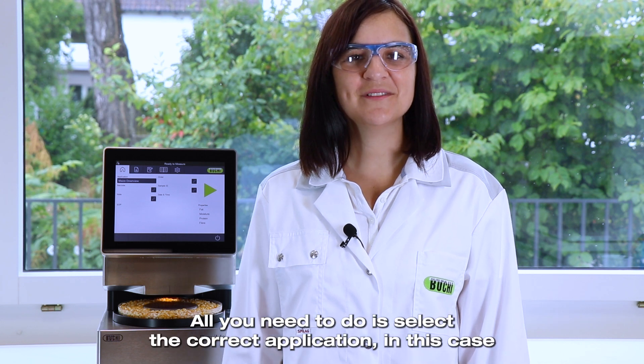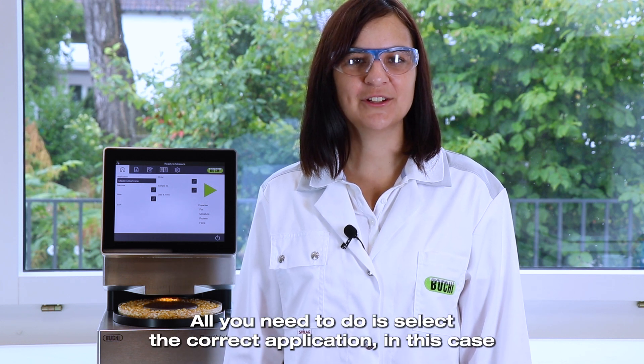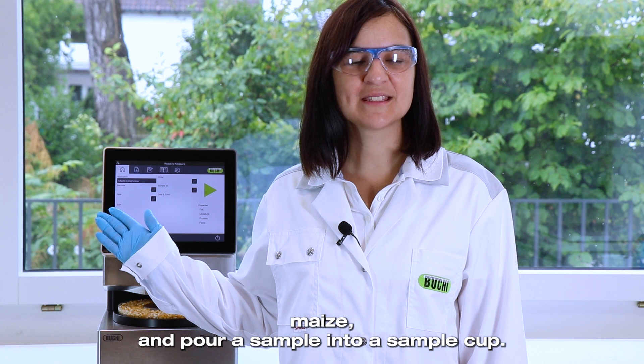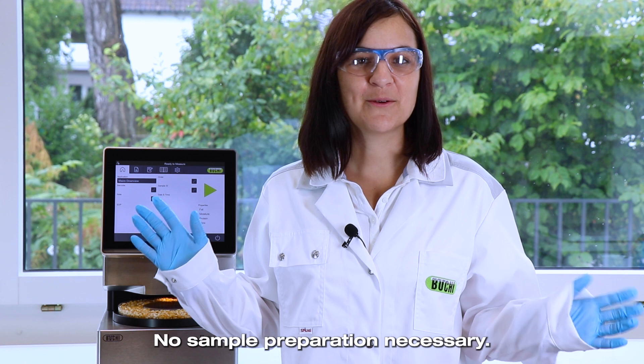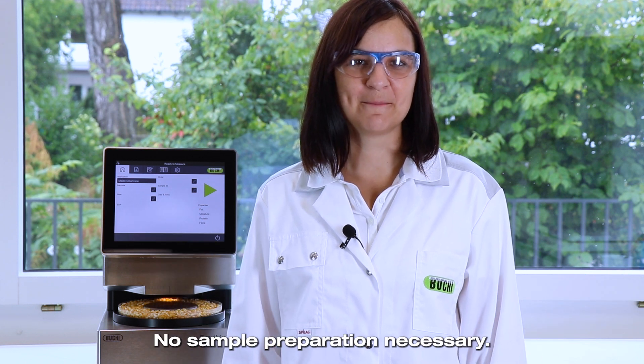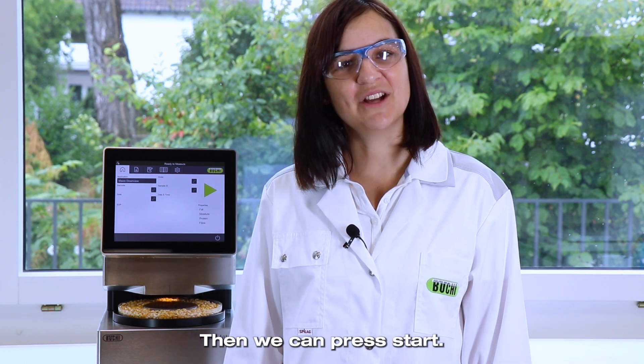All you need to do is select the correct application — in this case Maize — and pour the sample into a sample cup, like this. No sample preparation necessary.